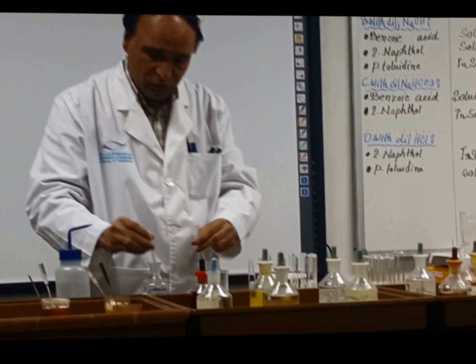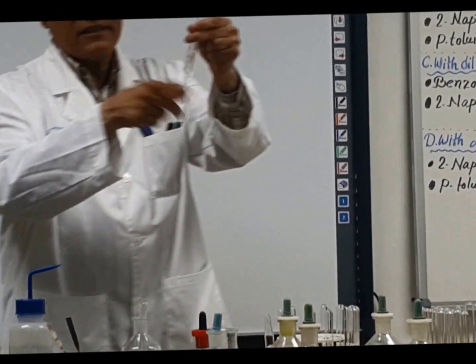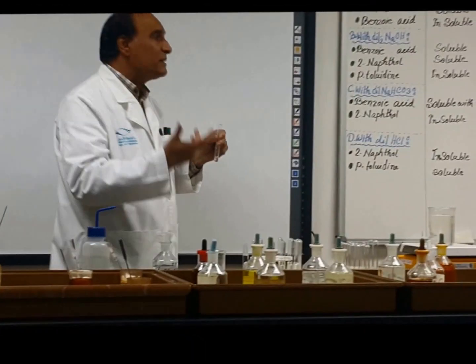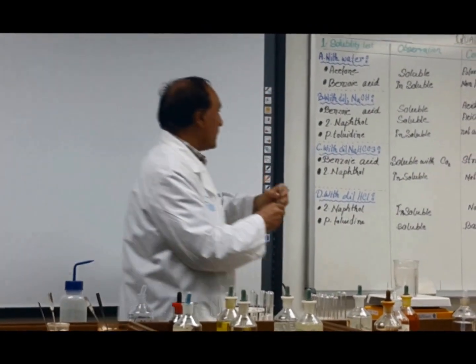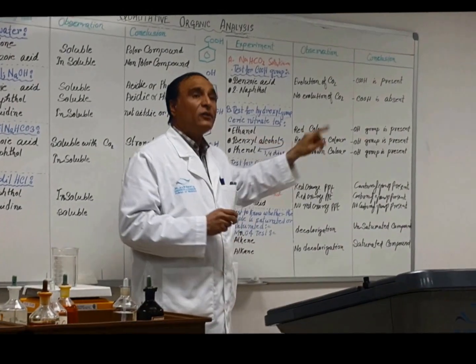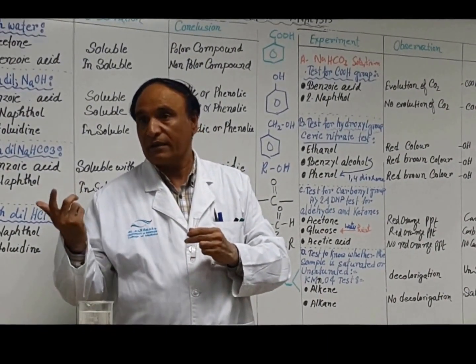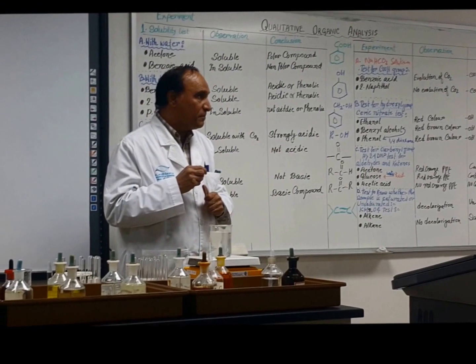Now I take sodium hydroxide, and if I try to dissolve it, it will never dissolve, because paratoluidine is a base. A base will not dissolve in a base. So we will say paratoluidine: insoluble, not acidic or phenolic. Don't give any other name. So not acidic or phenolic, because it does not dissolve. Did you understand? Yes, yes.